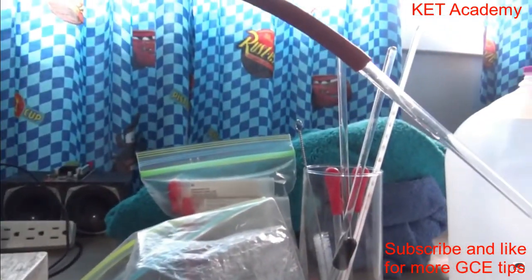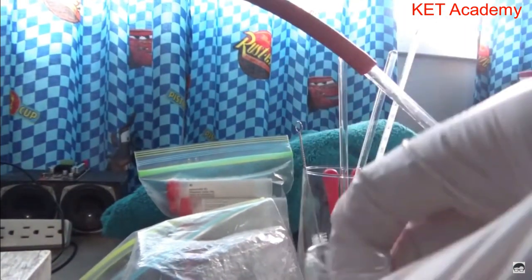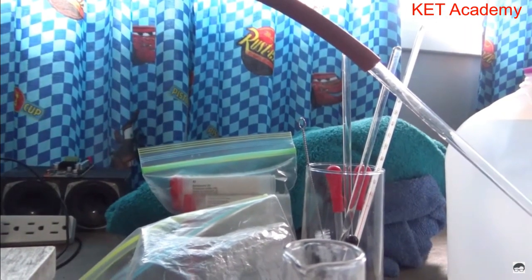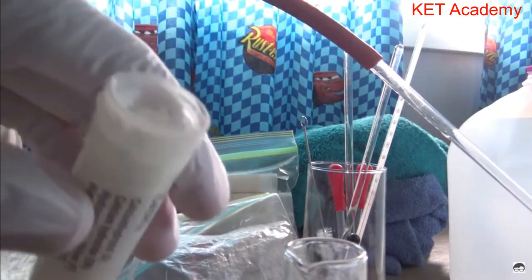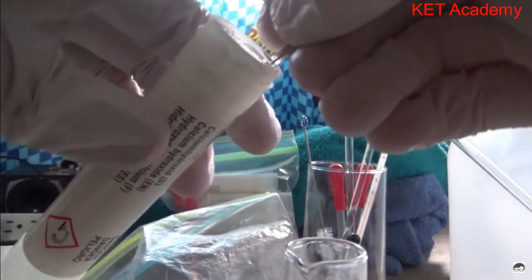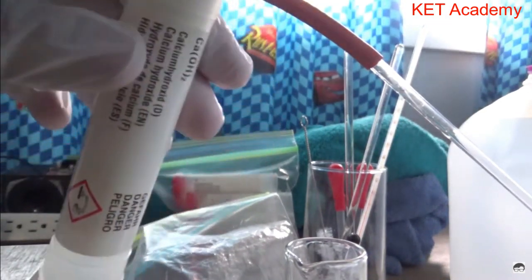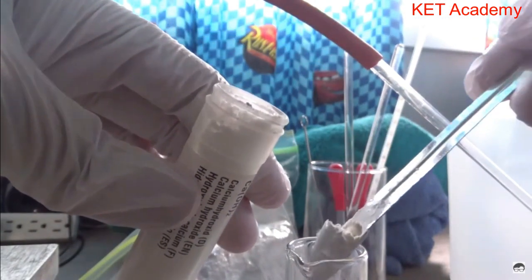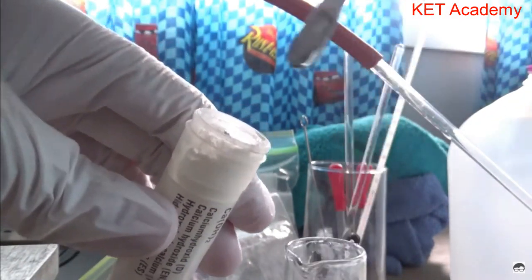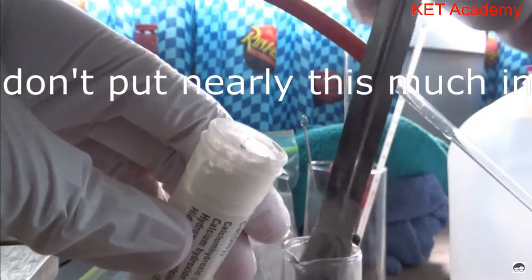Alright, so now I'm going to put this here. That's my graduated cylinder. And I'm going to take my calcium, what is this, calcium hydroxide? Yep, calcium hydroxide. I'm going to put a little bit of this. Whoa, that's a lot. I'll put a little bit of this. Oh, I'm spilling it everywhere, crap. Into the graduated cylinder. Just like so, put a little bit more. Just like so. Okay, don't do what I just did.